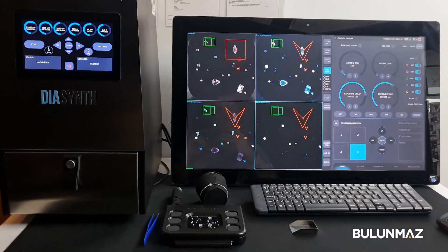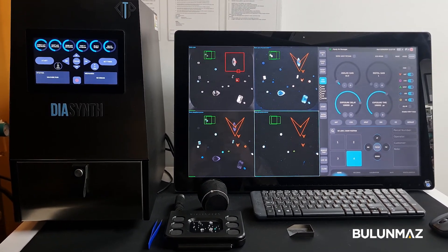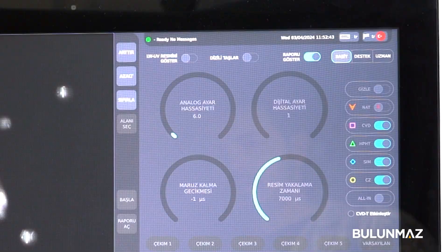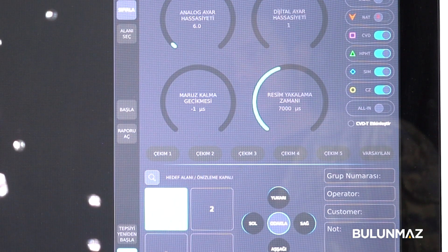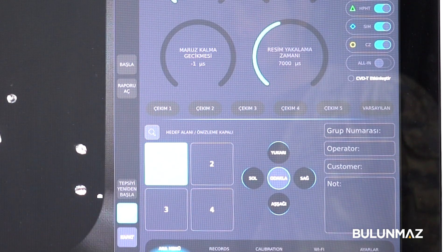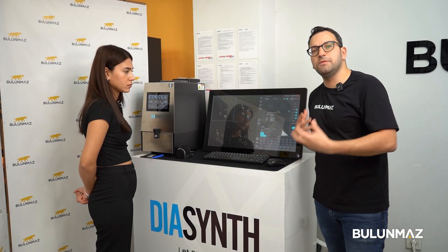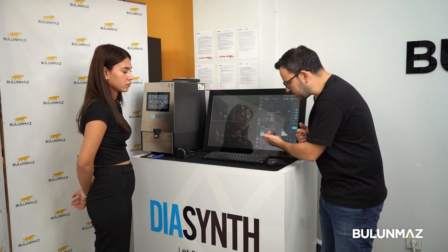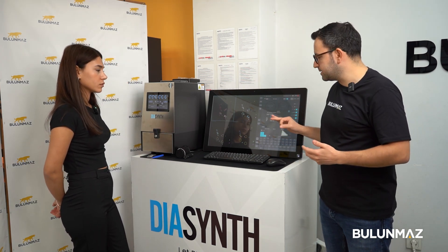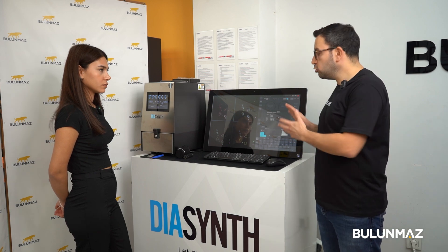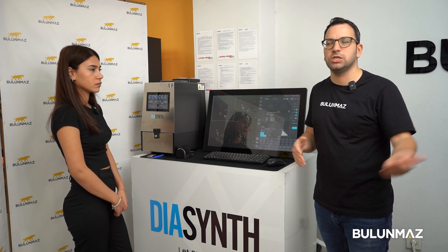The final report shows: four of the stones are natural — which is what I was looking for; two stones are CVD — which I needed to find and remove from my lot; three stones are HPHT — another kind of artificial stone; three stones are simulants — meaning moissanite or similar non-precious stones; and six stones are CZ — which I also have to take out from my lot. This is the visual report on screen. I can put notes about the parcel and it saves with the test, so when I open a previous test I can see all my comments.